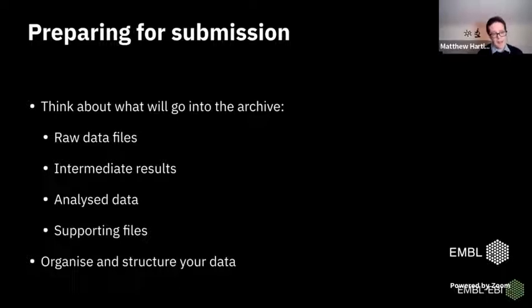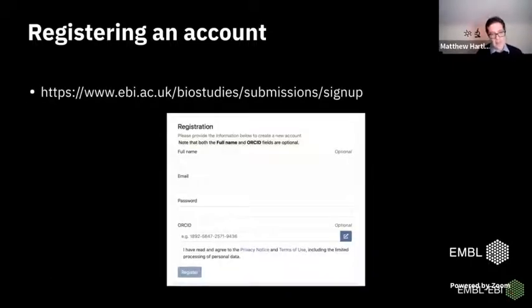And in fact, we're keen that the data sets are as complete as possible. By complete, I mean that somebody else should have all the information and pieces that they need in order to understand your data. So think a little bit about whether you should include some of the intermediate stages of your analysis, if somebody else will find it very difficult to reproduce that analysis without them, and include those. And then organize them locally into some kind of sensible directory and file structure at your end.